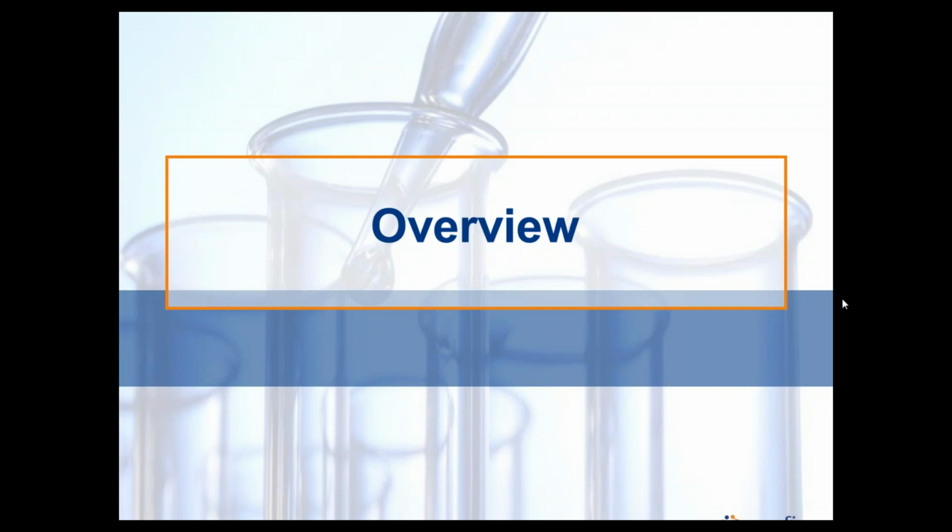What we're going to do is have a conversation about how raw material or foreign material identifications are performed. When we're doing this work, we're talking about something that is in a product or a material or an ingredient that shouldn't normally be there. It's not expected to be there. So we're going to talk about some of the testing that is done to identify these materials. We're also going to talk about how the techniques we use are applied. And then we're going to go into some detail about actual case studies that we have encountered over the years.